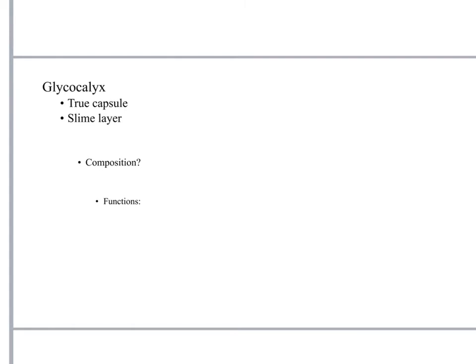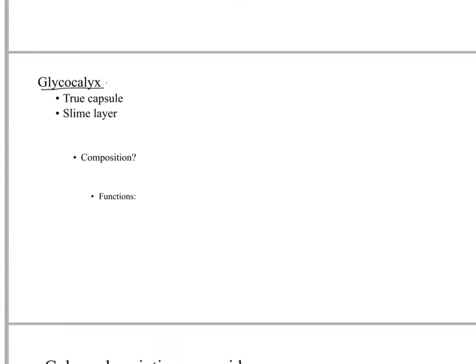A glycocalyx is a general term given for a slimy substance secreted outside of the cell.